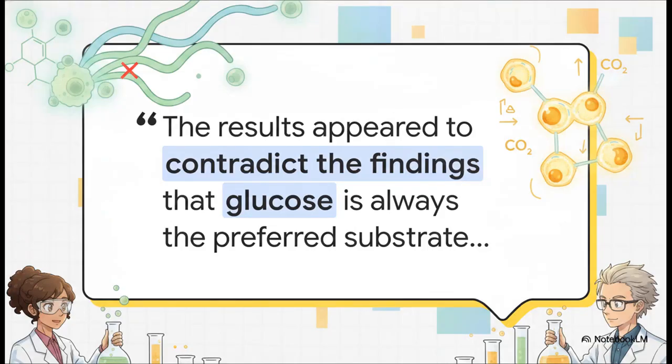Well, real-world experimental variance often completely challenges established theories. The literature says yeast loves glucose best, but our specific lab run showed a massive preference for sucrose. It really suggests that, hey, maybe we need a larger sample size, or we need to look closer at the specific strain of yeast we're using to definitively map population-level behaviors. Science is all about constantly testing your assumptions.